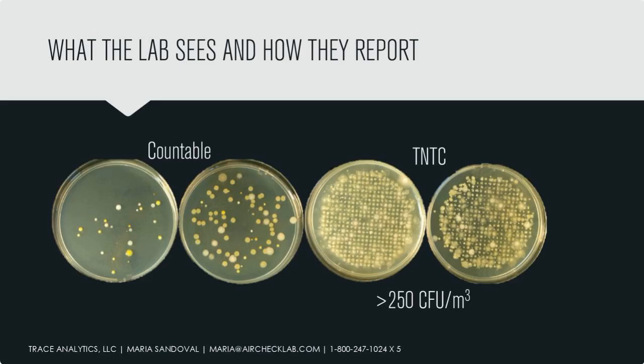This is also a higher bioburden. So this plate has fewer CFUs than this plate. And this would be considered too numerous to count. There's just too much growth on this plate.